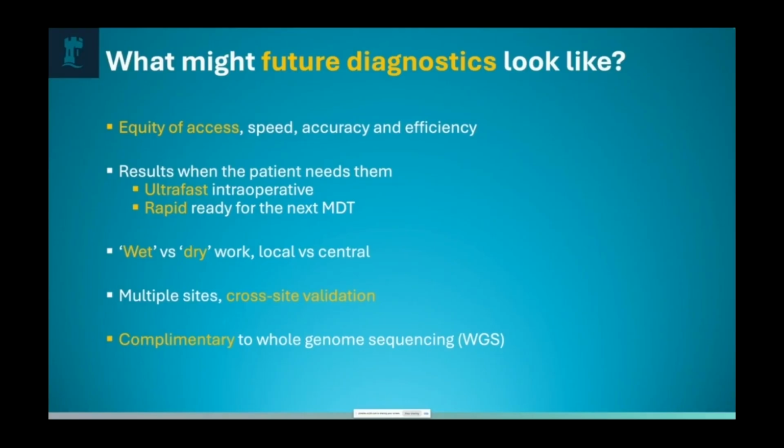In the UK, we have whole genome sequencing, we have Genomics England driving a huge number of samples through, and that's absolutely fabulous. This allows us to almost uncouple the rapid classification that's required from the longer term discovery process that happens through whole genome sequencing.